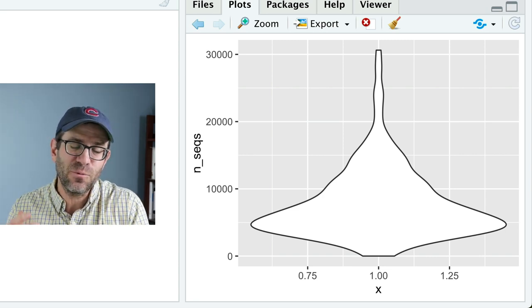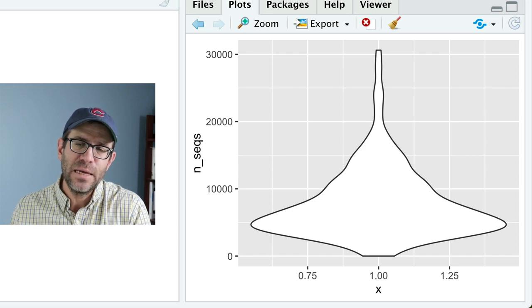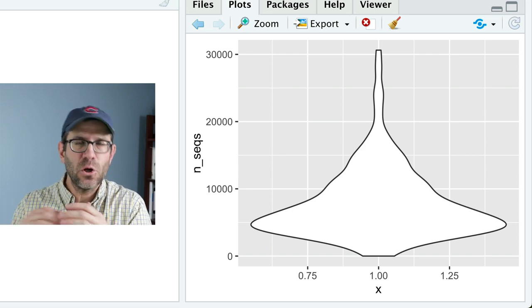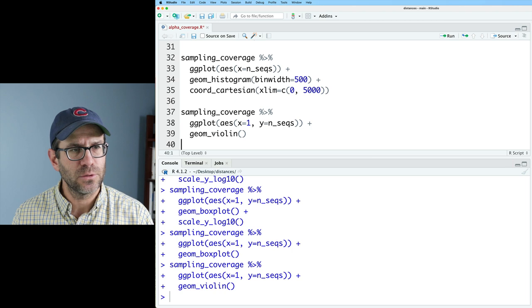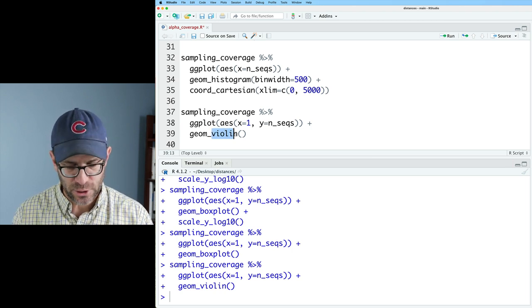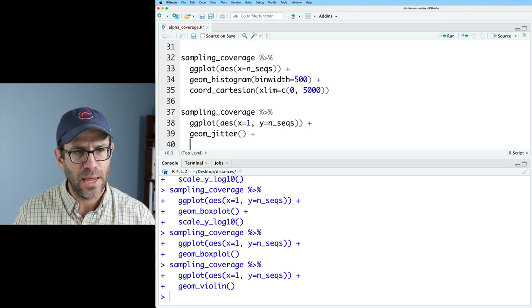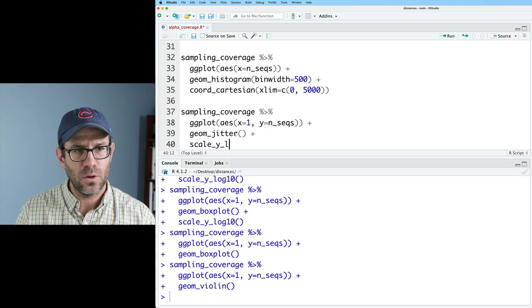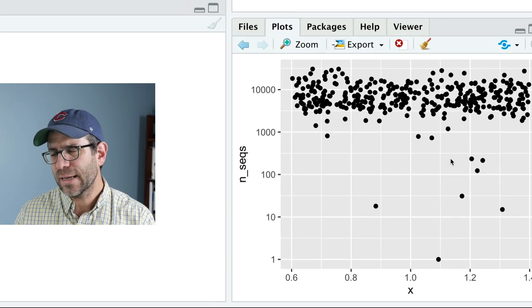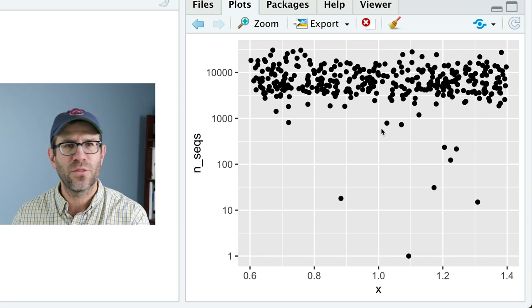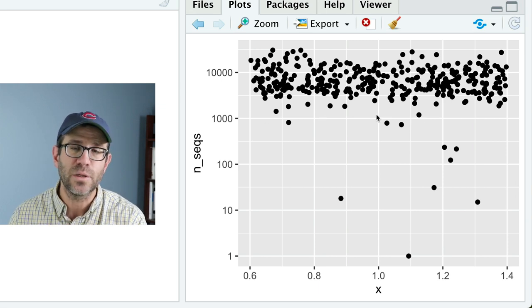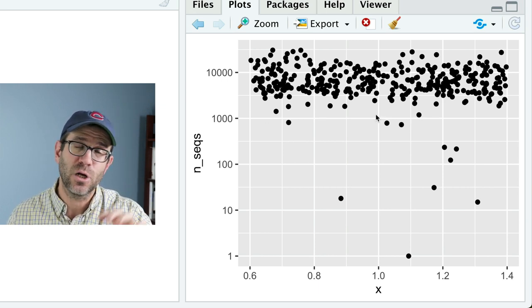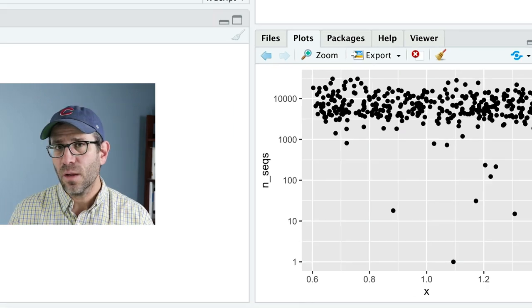An alternative to geom box plot would be geom violin. This gives you the shape of the distribution. And so where it's the widest, we have the most data. And where it's the most narrow, like up at 30,000, we have the least amount of data. Also, this smooths things out a lot like we saw with geom density. I don't feel like it really gives me that much help to thinking about where I might want to draw that threshold. So I think I'll go back to my geom jitter and adding on the scale y log 10.